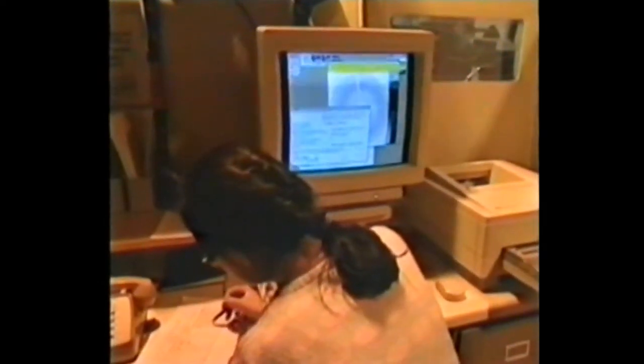Sussman's current work at Brookhaven involves testing this backdoor hypothesis. By generating time-resolved X-ray crystallography images, they can simulate the enzyme-substrate reaction. To do this, they synchronize the release of a substrate from the active site of the enzyme and then take X-ray images microseconds later. Only a few laboratories in the world could accommodate such experiments. Sussman's three-dimensional models are allowing many researchers to probe the subtle mechanism of this enzyme. One group of scientists at Cornell University has simulated what acetylcholine must feel like when it encounters this enzyme.